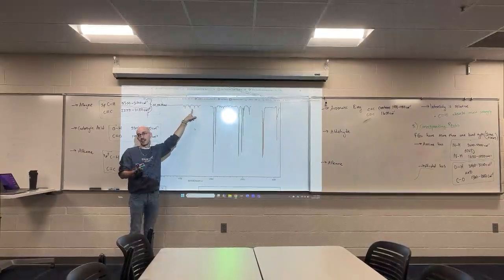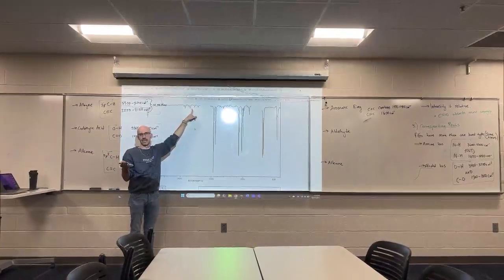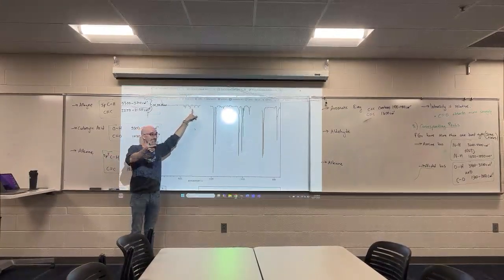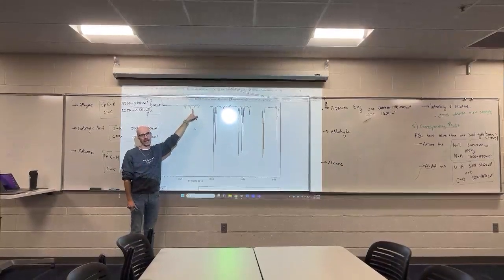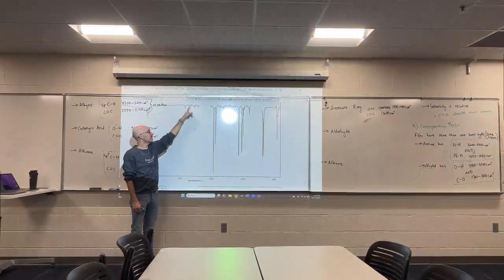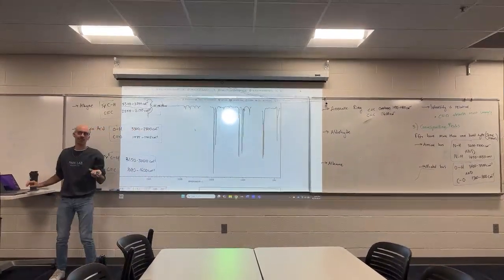I'm not going to lie to you. Most of the time, I want you to ignore small signals because there's a lot of things that just make some noise in your sample, and they're not meaningful to your analysis. But these actually are useful. So it can be easy to miss overtone signals.